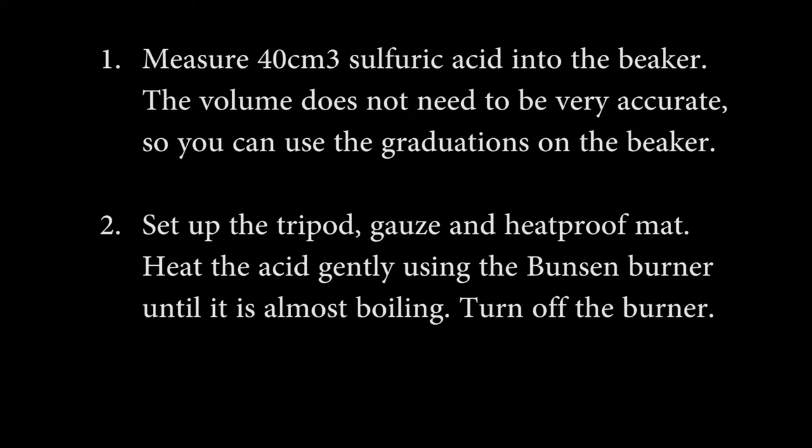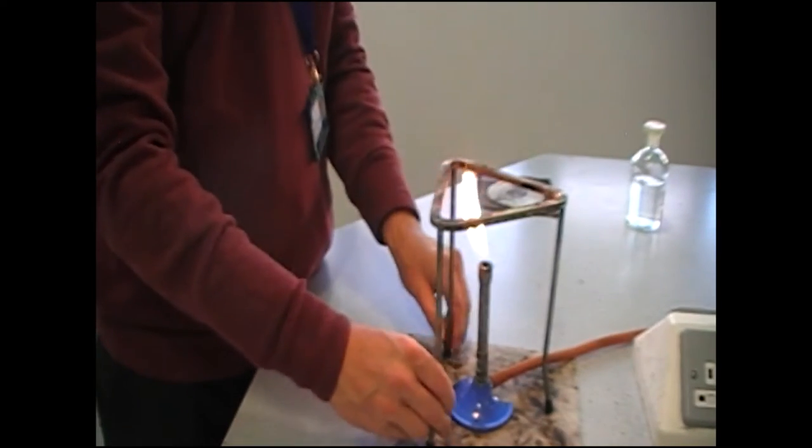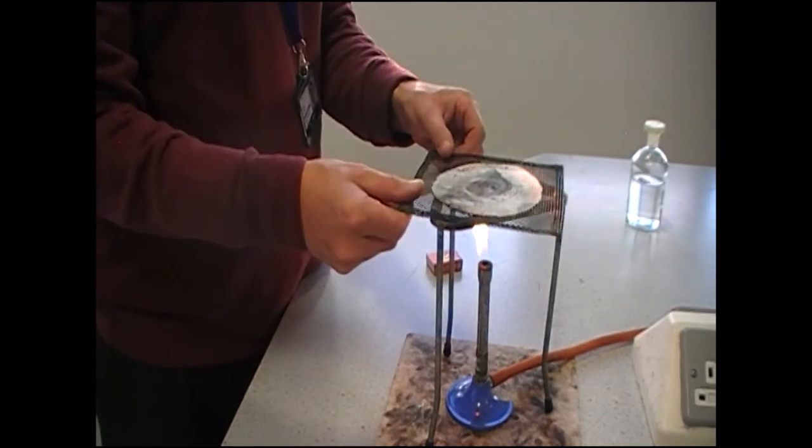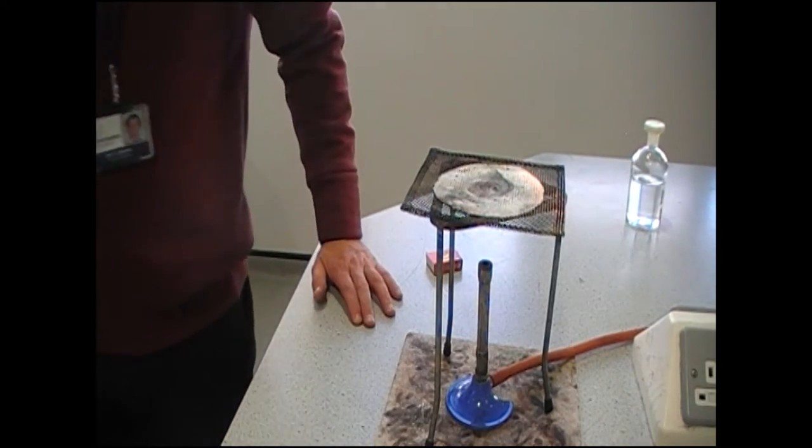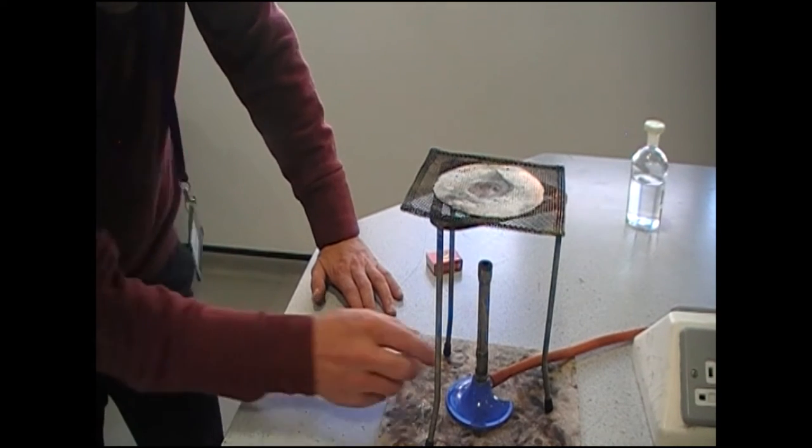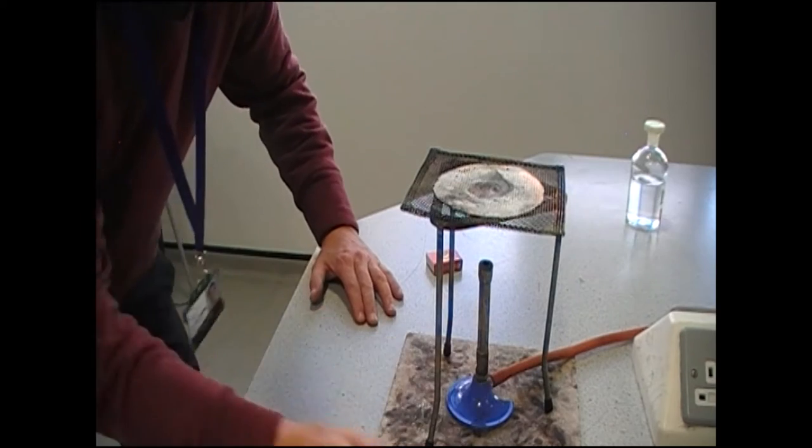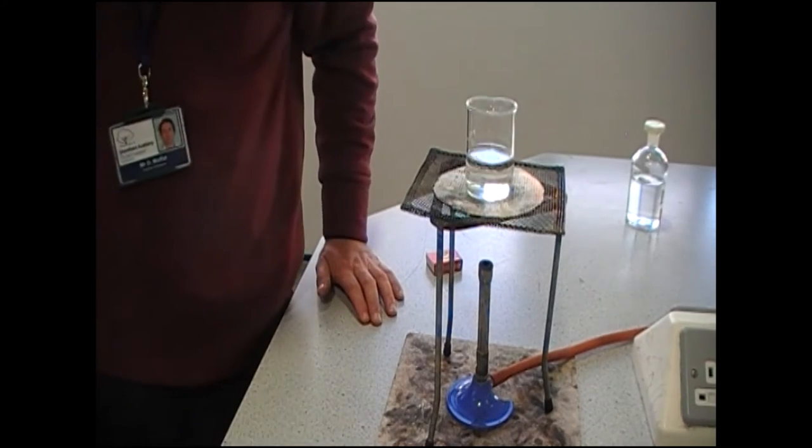Heat it up until you see it just beginning to bubble and then turn your Bunsen burner off. You should be stood up remember, we don't want anything landing in our laps. Heat the acid gently using the Bunsen burner until it is almost boiling. Gentle blue flame, not roaring.